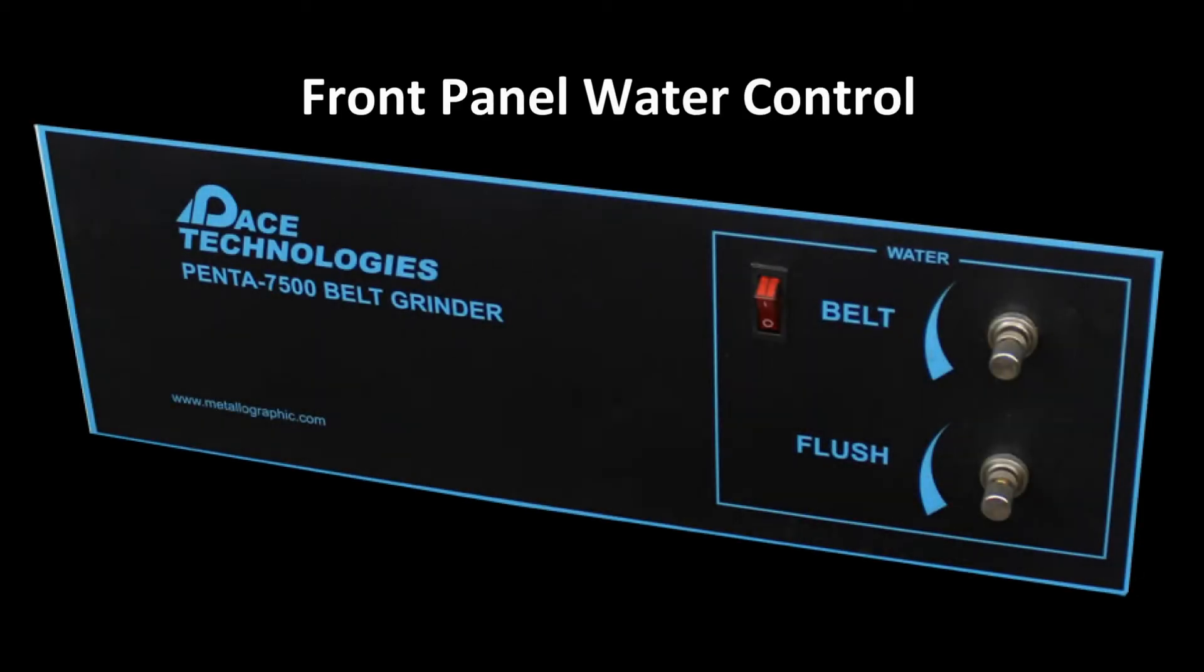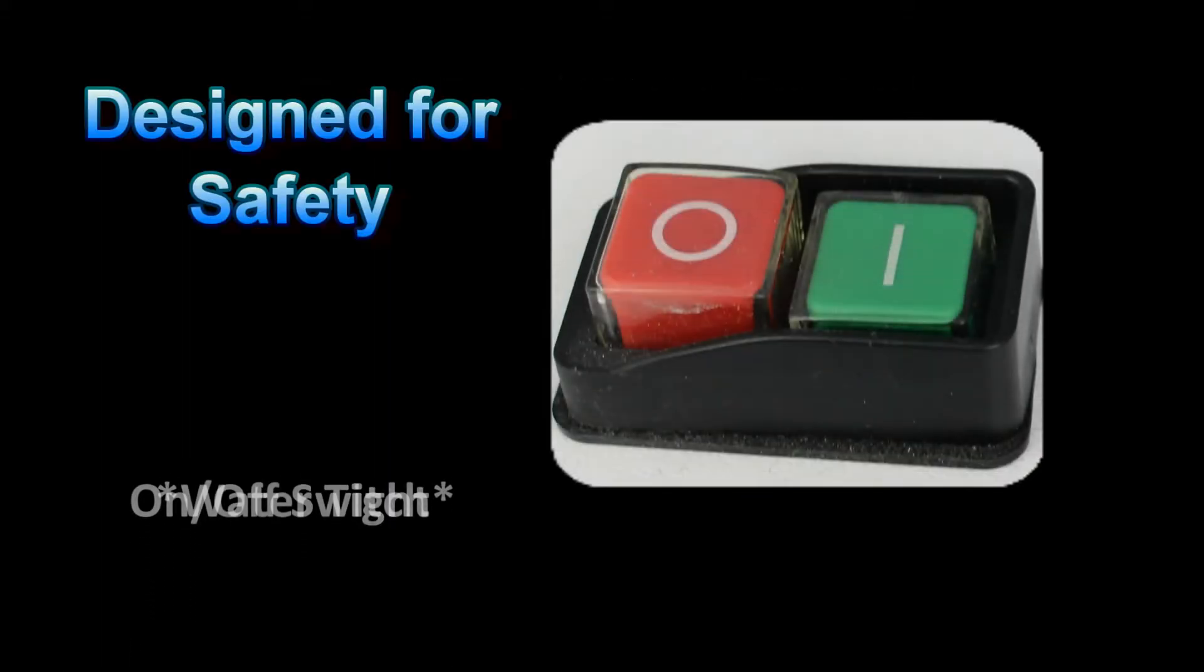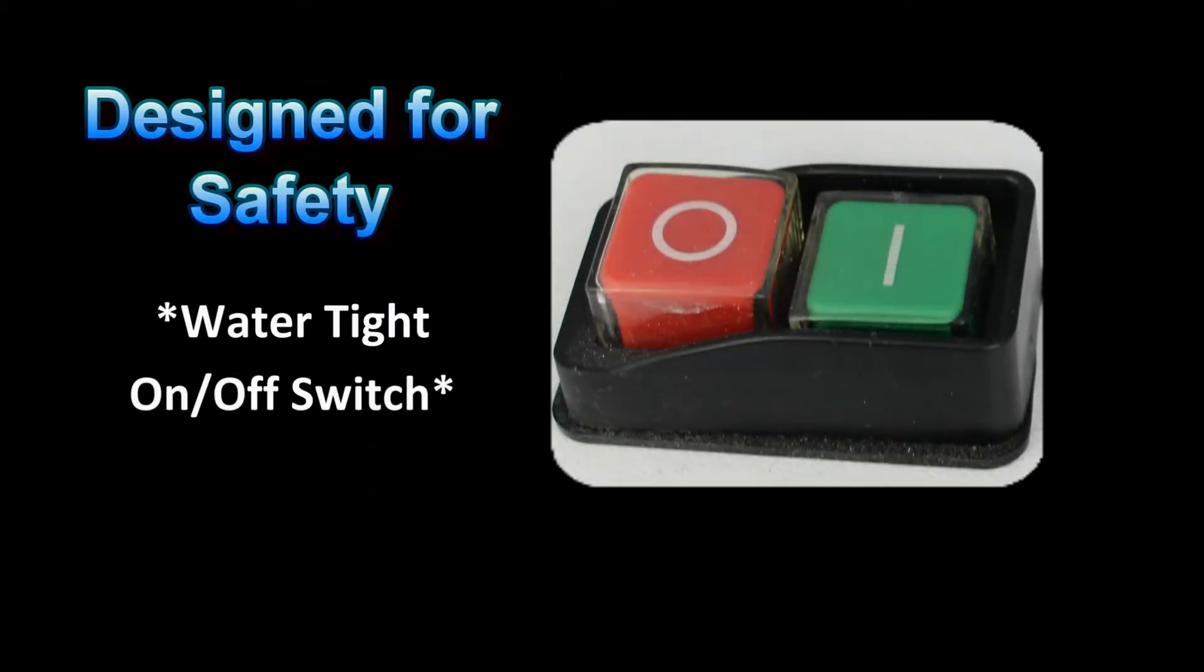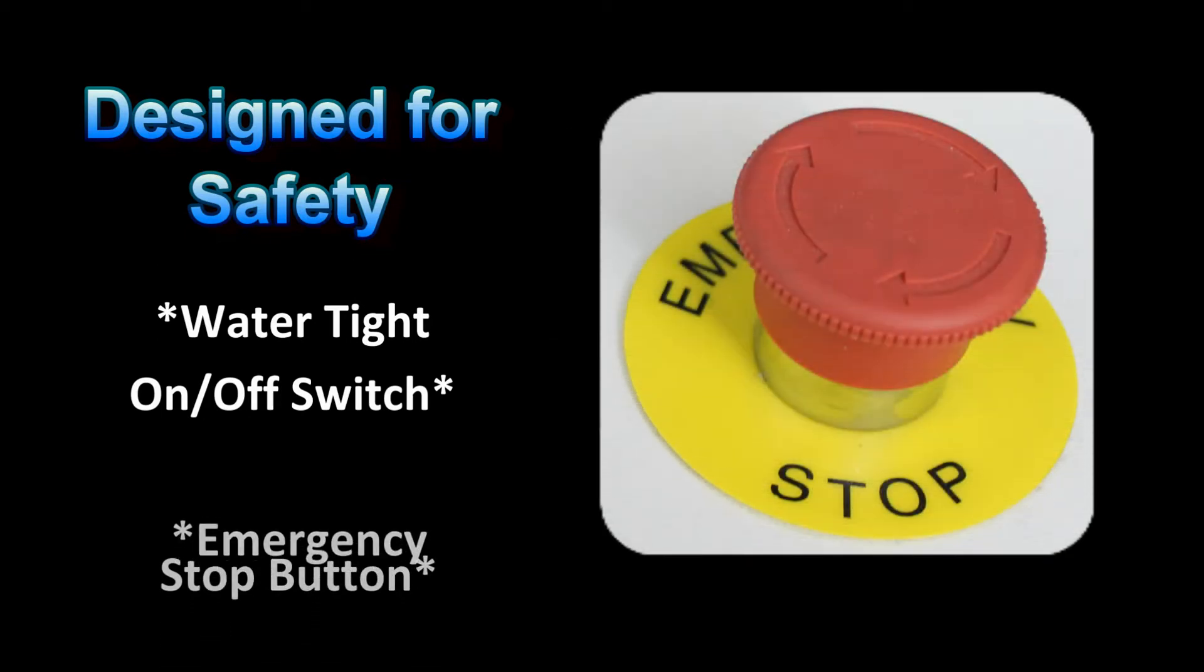The water flow to both the belt and the sink can be controlled from the front panel. The Penta 7500 has been built for safety with water-tight on-off switches and an emergency stop button.